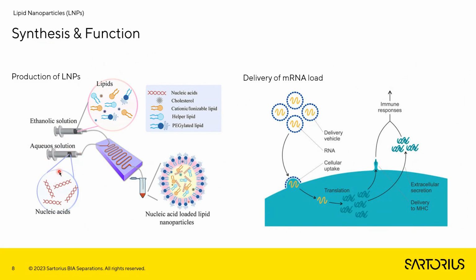One solution is an aqueous solution where nucleic acids are dissolved, and the other solution is an ethanolic solution of different lipids. These two solutions are mixed together, and at the end we obtain the nucleic acid loaded lipid nanoparticles.